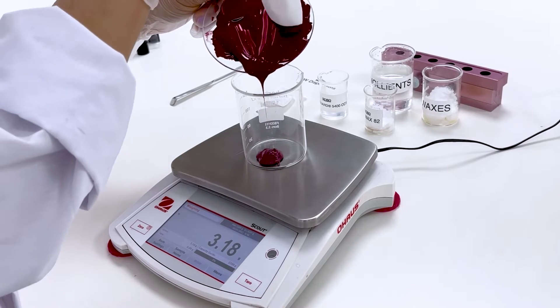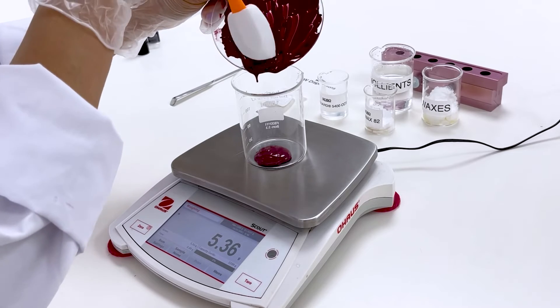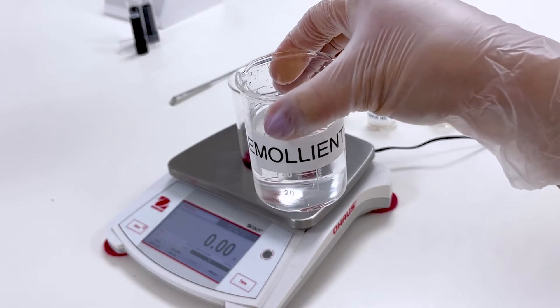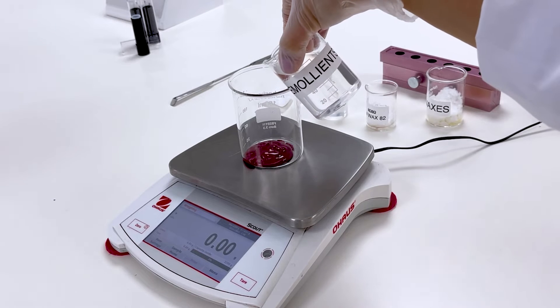As a result, only a small amount of pigment is needed to achieve a vibrant and striking color. We mix the pigments until a uniform color is obtained, then add to a beaker. Then we add emollients, which provide a soft texture and shine to the formula.